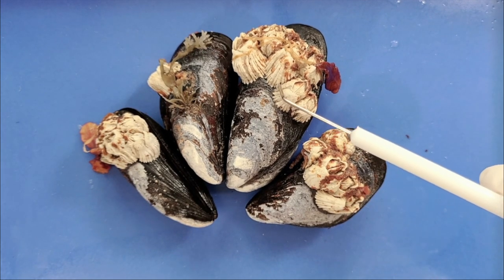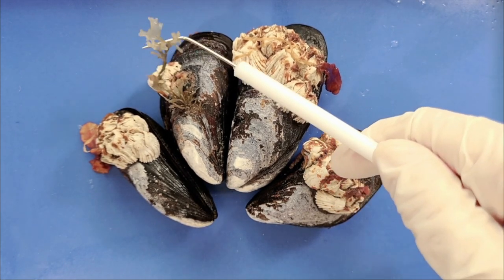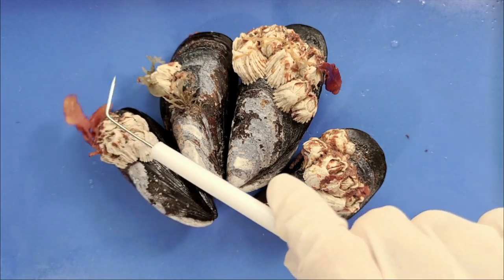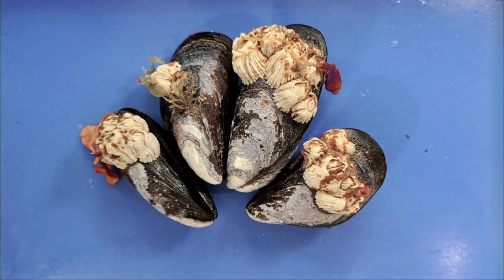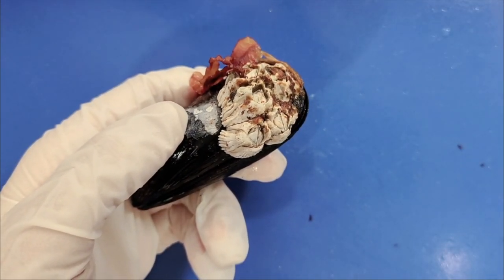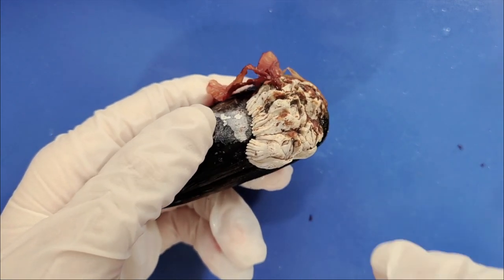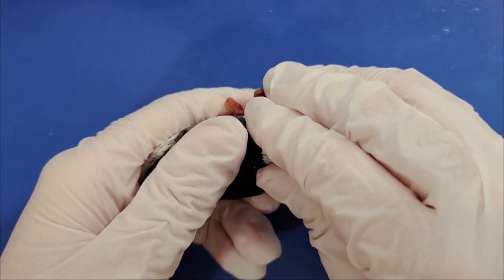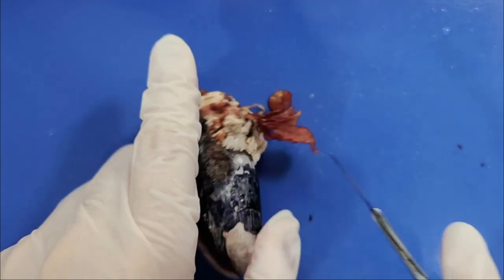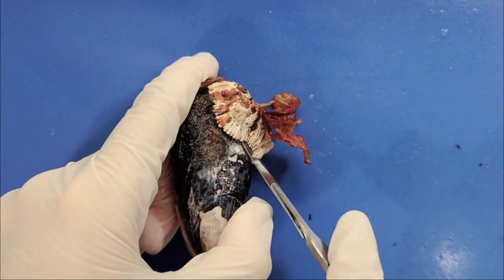These are all barnacles, and you can also see some seaweed right here and also here. So now let's take a look at the external anatomy. First I'm just going to remove the barnacles — we'll take a closer look at barnacle anatomy later. To remove the barnacles, just take a scalpel and wedge it under the barnacle and it should lift right up.